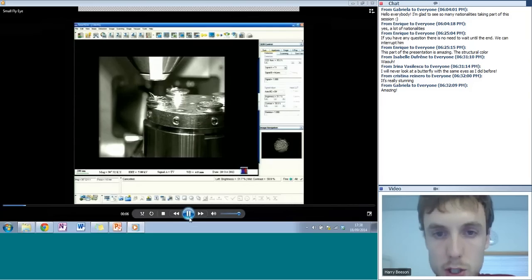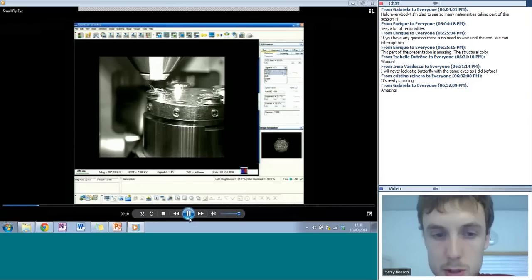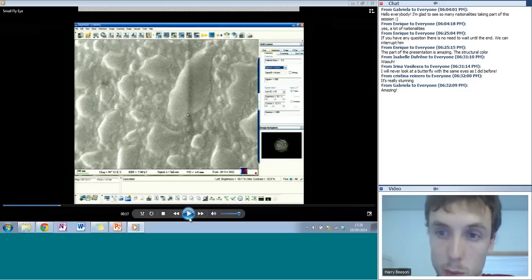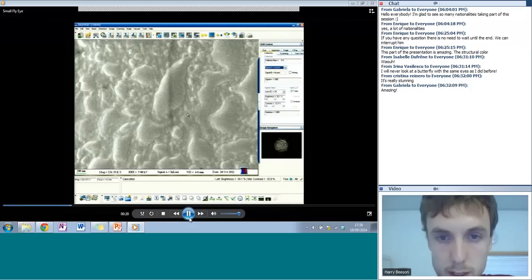So if you move the sample up towards the gun to start imaging, and then we switch to looking at the sample itself, you can see this time we've started off looking at very high zoom. We're going to zoom out of the fly's eye. Again, if you look at the scale bar, you can see it's 200 nanometers. And as we zoom out, that will slowly decrease.